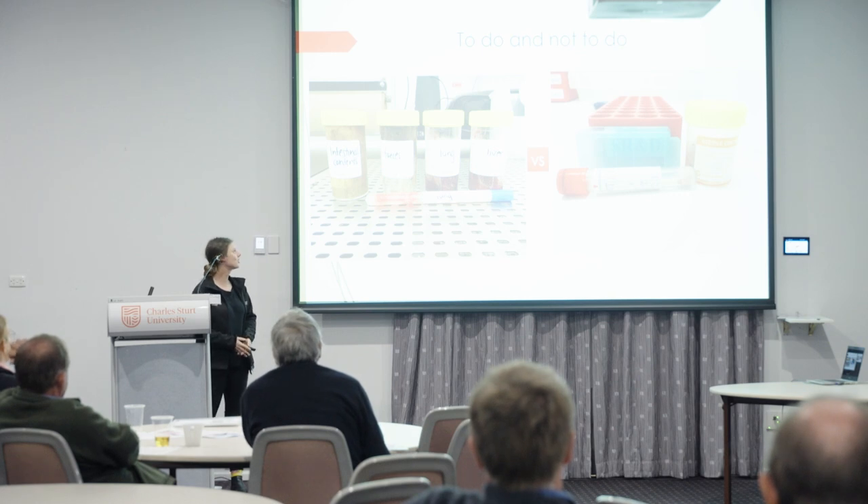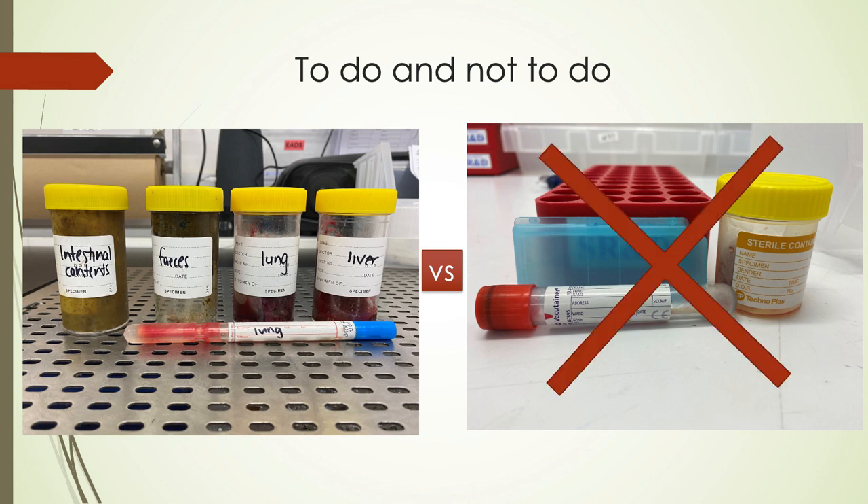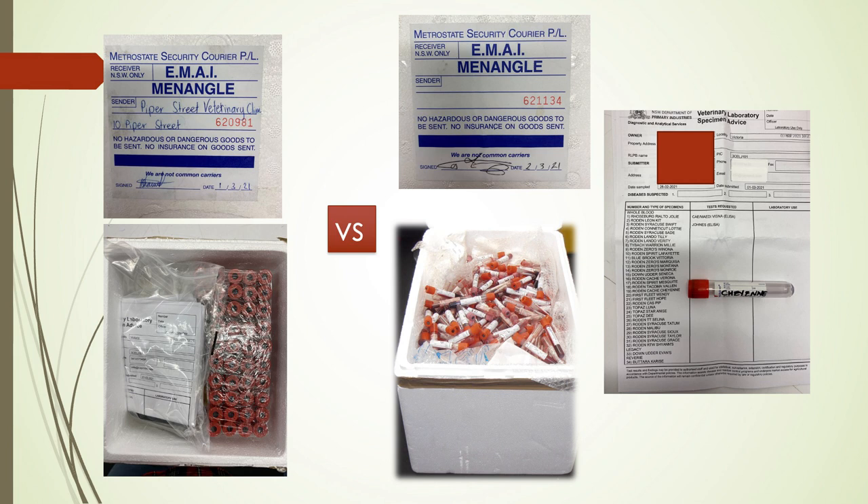A quick summary of dos and don'ts: on the good side, we have nicely labelled pots, clearly filled-out paperwork with the specimen details at the top, and blood tubes neatly packaged. On the bad side, unlabelled swabs with no indication of organ of origin will result in a call back to you. If tubes aren't packaged they'll jumble in transit and our staff have to reorganise everything. Please label your samples and package them properly.